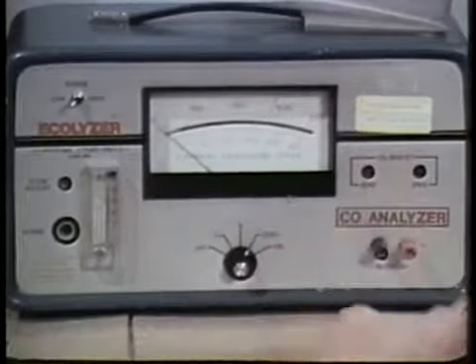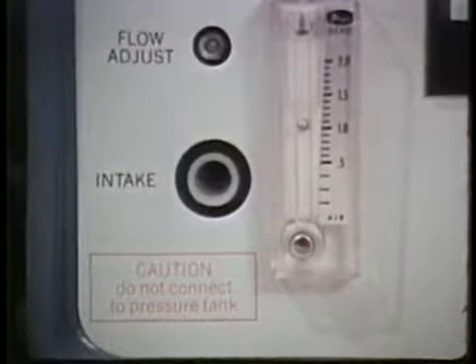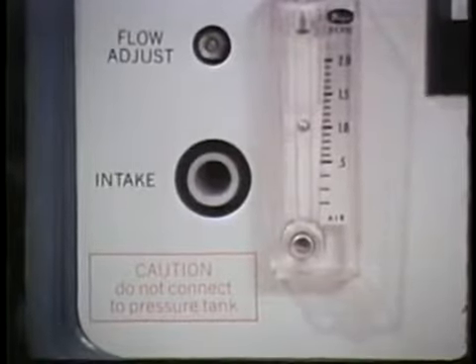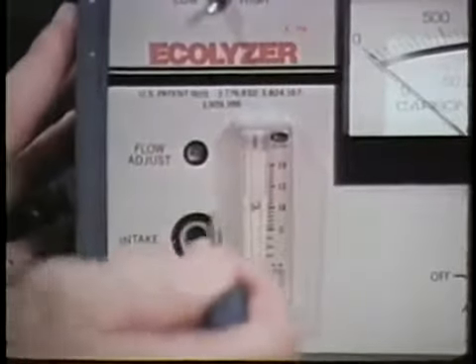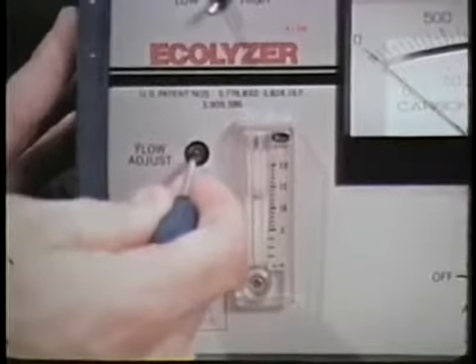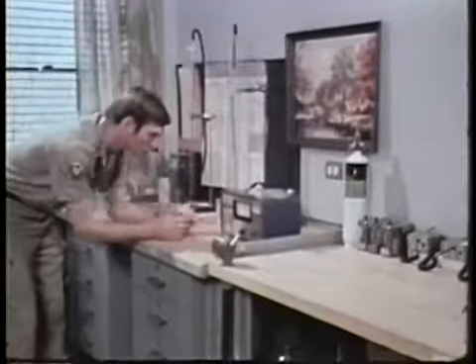Now turn the meter on. And you're ready to adjust the flow rate. The rate at which air or gas is being pumped through the unit is shown by the flow meter. Adjust the rate to 1.5 liters per minute. The next step is the span check.